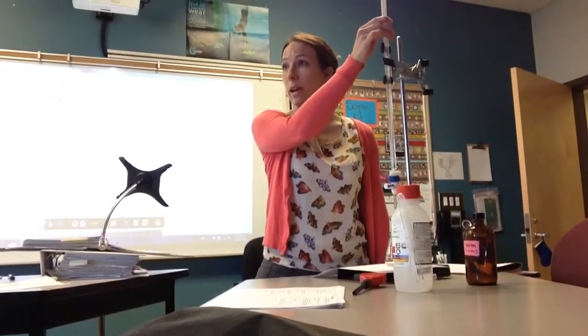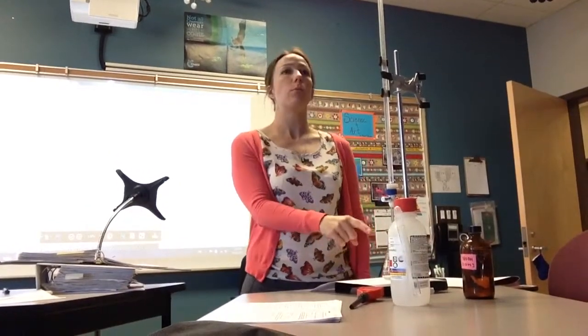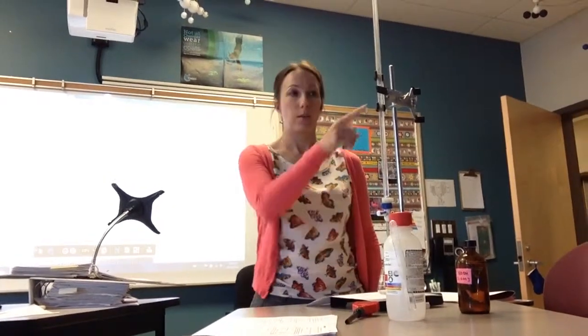Titrations you should know already. You should know that this is called a burette, right? You should know that I pipetted exactly 10 mils so that it was a more exact measurement of my volume. So it's 10.00, whereas if I used a measuring cylinder, it could be 10.1 quite easily. It's not as exact, precise measurement. So burette and a pipette to get my volume in there.